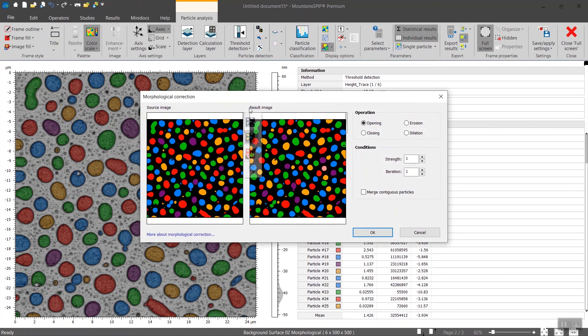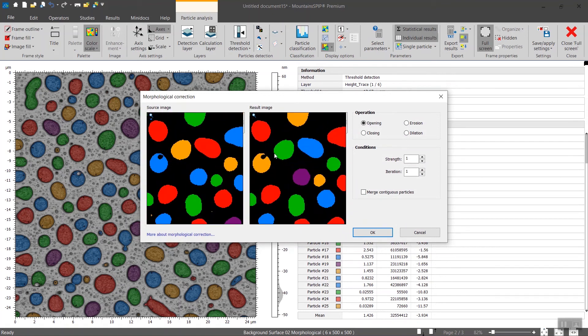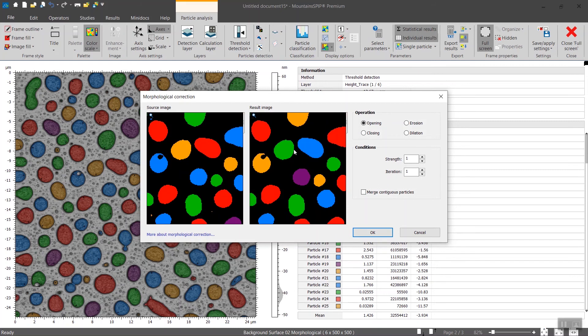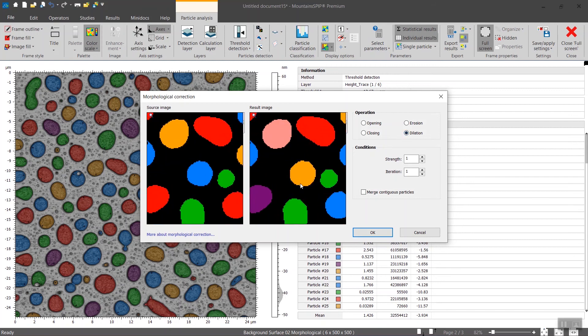The idea behind morphological correction is to add a couple of pixels around these or remove a couple of pixels around. You can merge a particle, you can divide them a bit. But in this case we want to increase the size of each structure to avoid the edge effect in the exported surface. And to do so you select dilation, and then you can increase the strength like that. You click on okay.